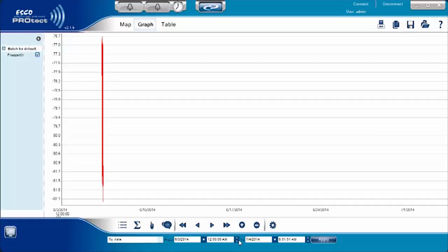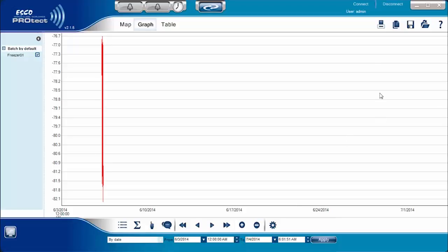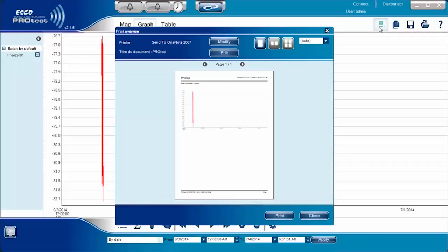On the upper right corner of the screen, users can also choose different icons such as print, copy, save, and download an archive. By choosing print, for example, the ProTech software will show an overview of the graph as displayed on the screen before printing. The printing options will be directly configured with the printer.